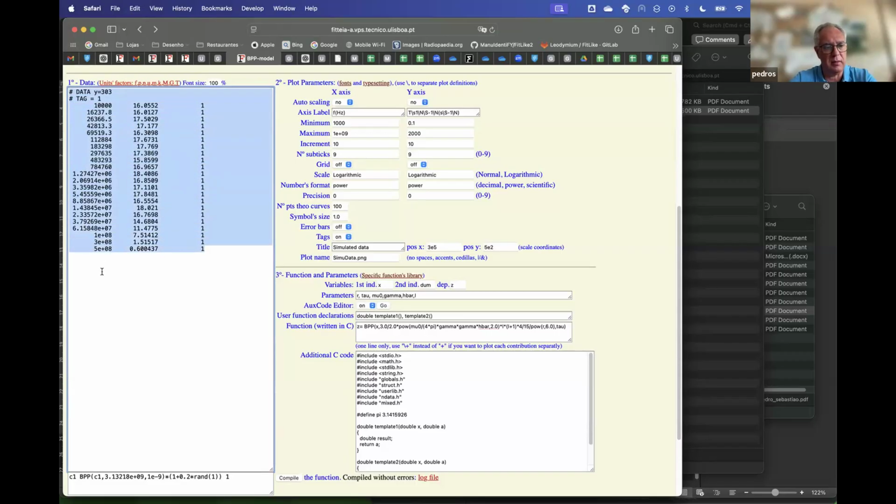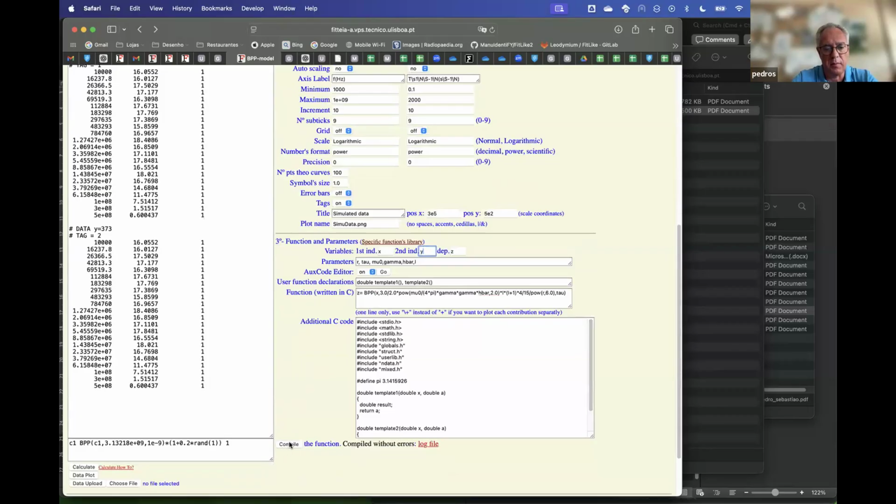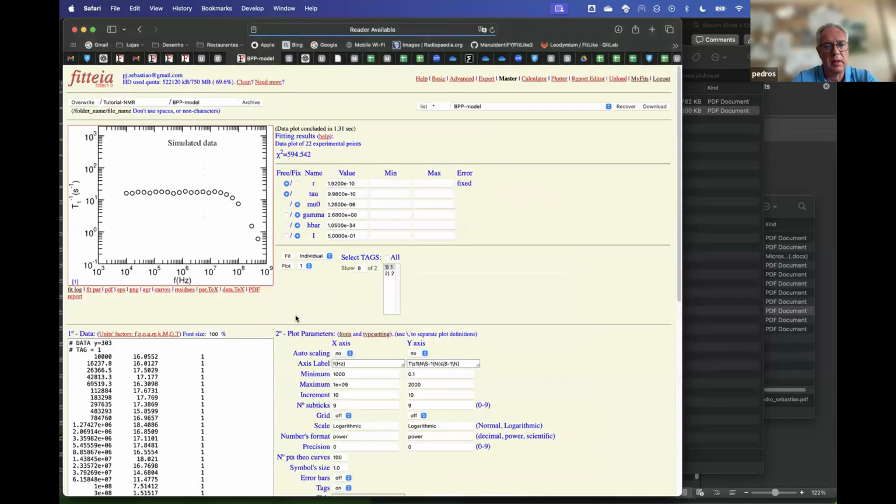And if I copy and make here a second block of data, this will be the second block of data. And if this would be a temperature, this could be another temperature. But since I declared the second independent variable as dum, instead of y, I should have dum. Or vice versa. I could keep y here and put y here. Okay? Let's compile again and try again.